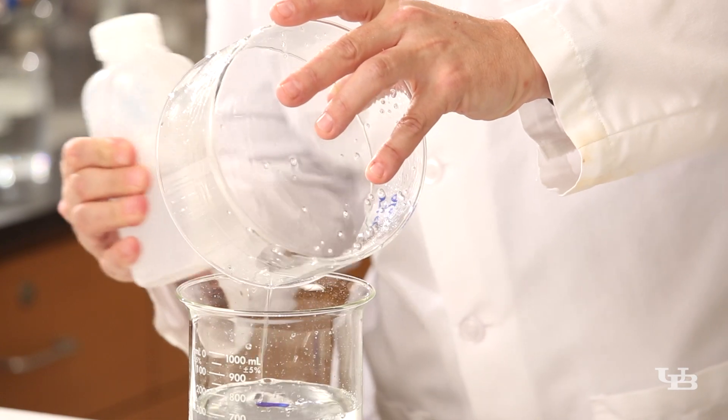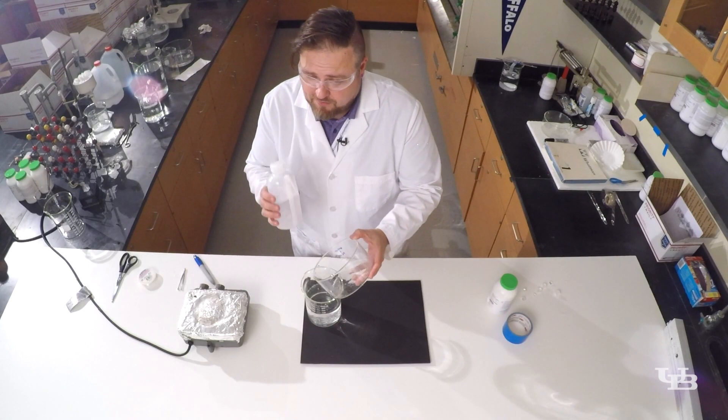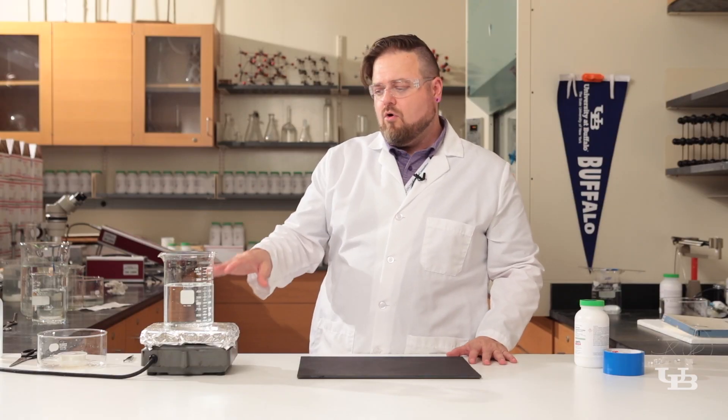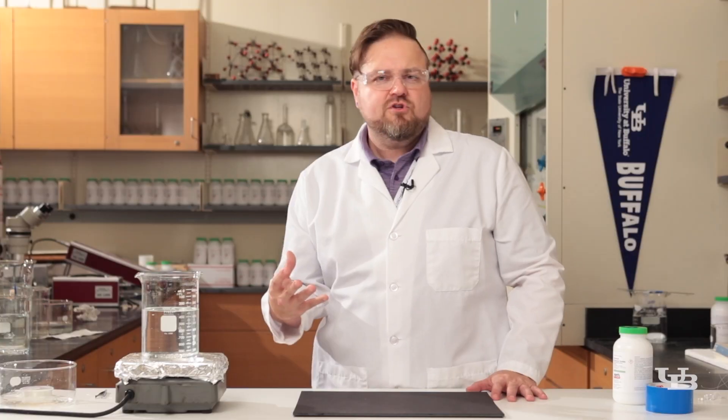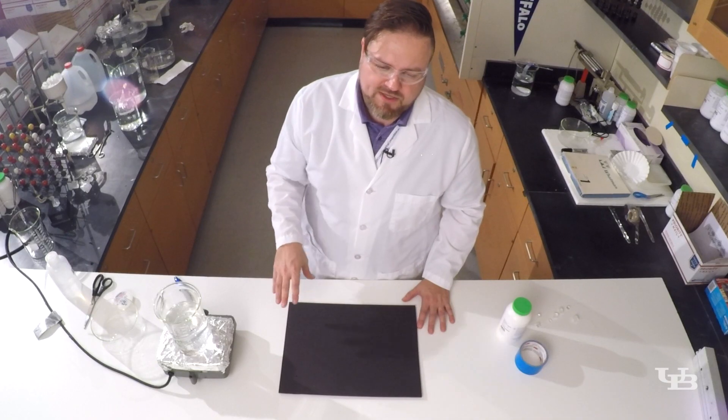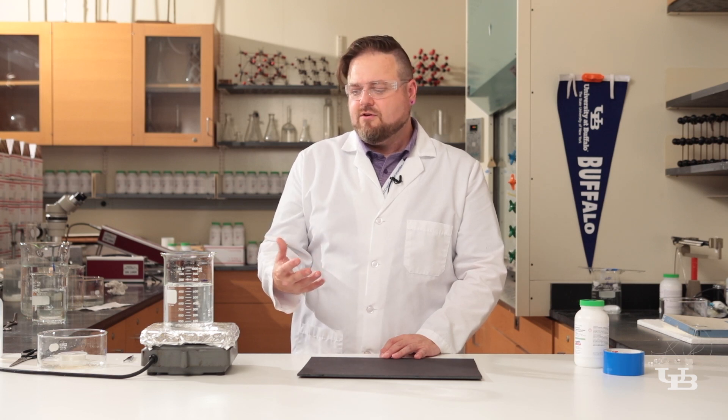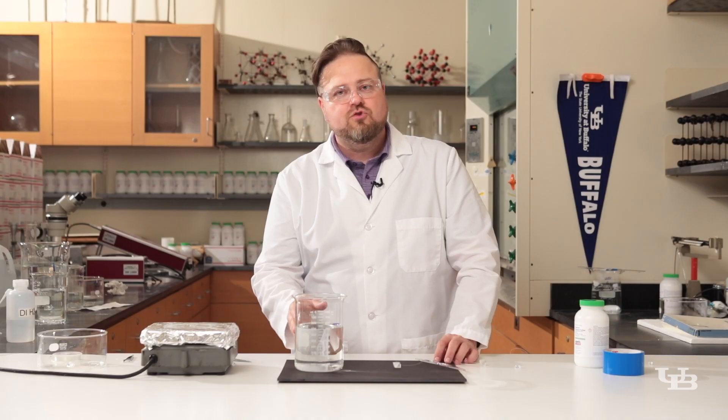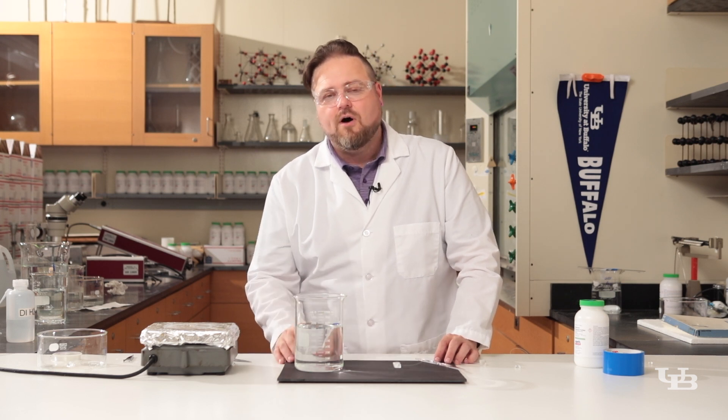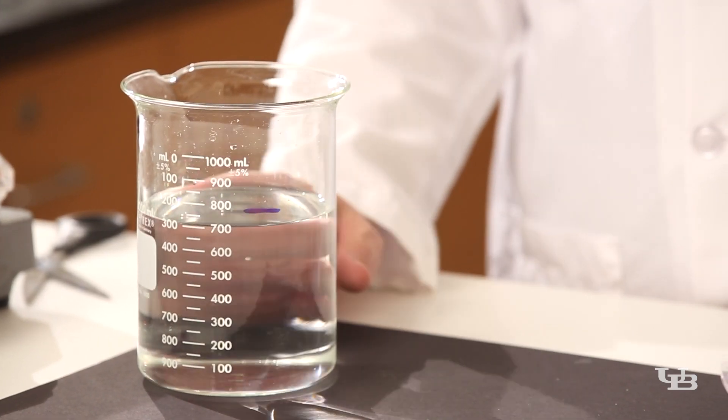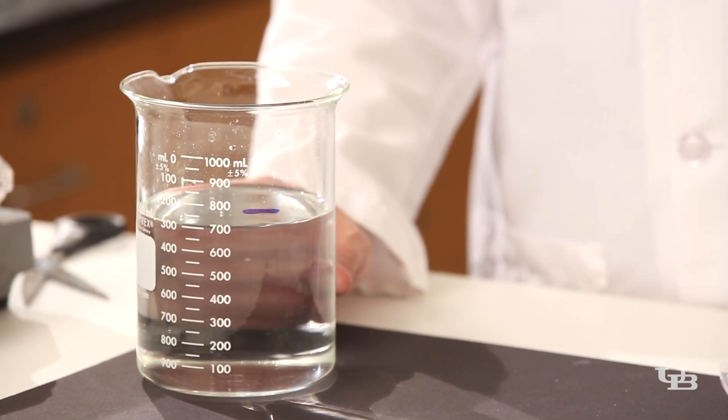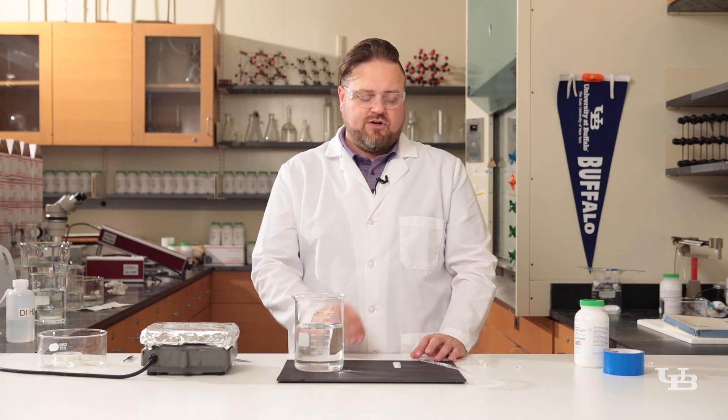We've added a little bit more water back in through the process of cleaning our dish. But how much water do we want? The short answer is we definitely want less water than that. This blue line indicated the amount of water we used to initially grow the seed crystal. If we put that much water back in it's just going to redissolve our seed crystal. We want a little bit less water than that. Too much water and the seed crystal's going to dissolve. Too little water and the alum is going to crystallize out incredibly rapidly and could potentially destroy the seed crystal. You want just a little bit less water than you started with for your seed.